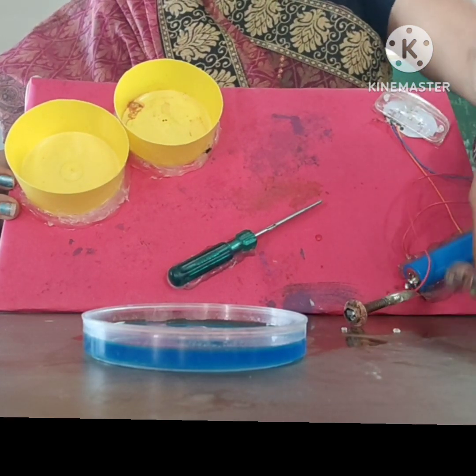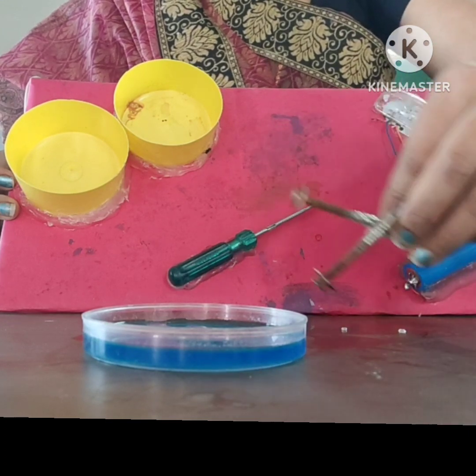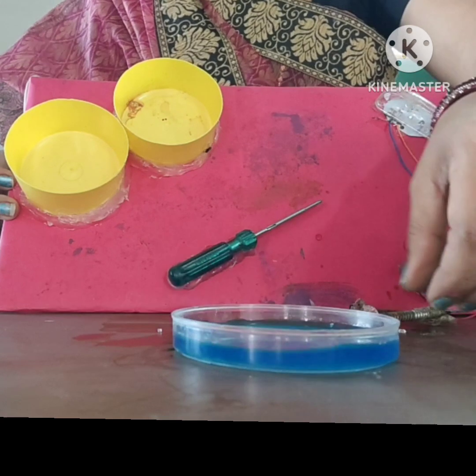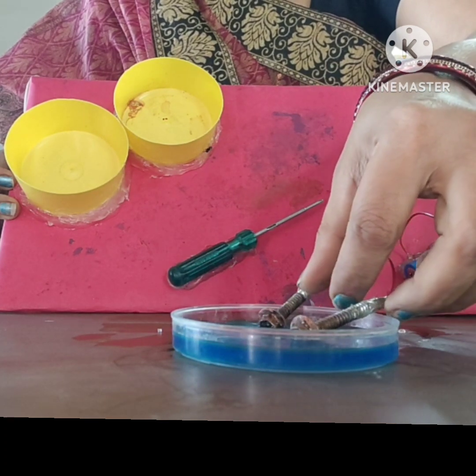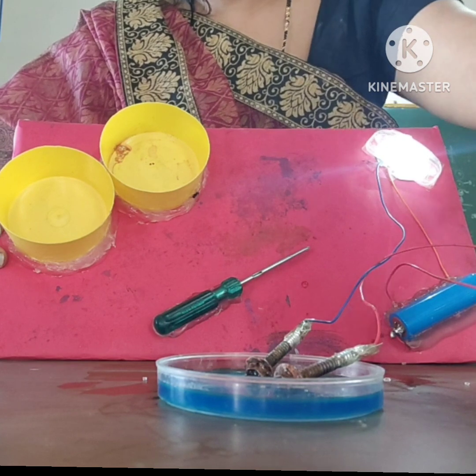Hello everyone, today I am going to show you an activity to check whether a solution acts as an electrolyte or not. For that, I have taken copper sulphate solution — we all know that it is an aqueous solution. I have made a small circuit; these two are electrodes. Now see, the circuit is complete and the LED glows.